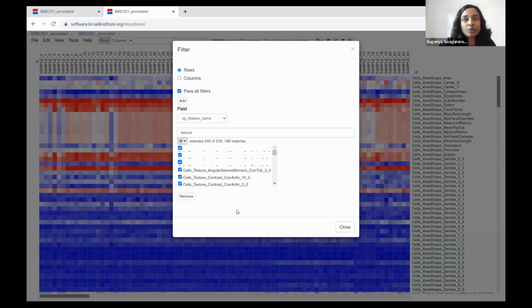We don't want to give a lot of importance to texture just because there are a lot of measurements. We want to give equal importance to the different measurements, so that the similarity matrices formed at the end use each of these measurements with equal weightage, rather than a different weightage based upon the number of measurements. This is why we want to do feature selection.